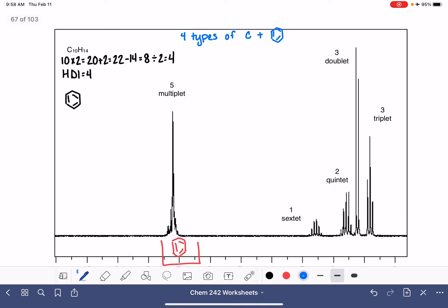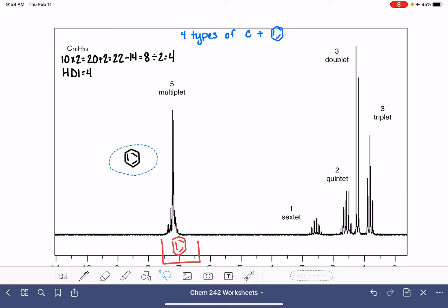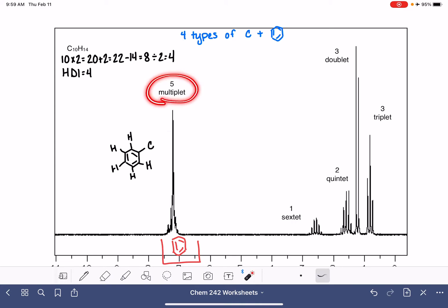For our proton NMR, we can start by focusing on that benzene ring. We know that we have the benzene ring and it's integrating at five, which tells us that there are five hydrogen atoms on the benzene ring. So we've got that part of the molecule figured out.